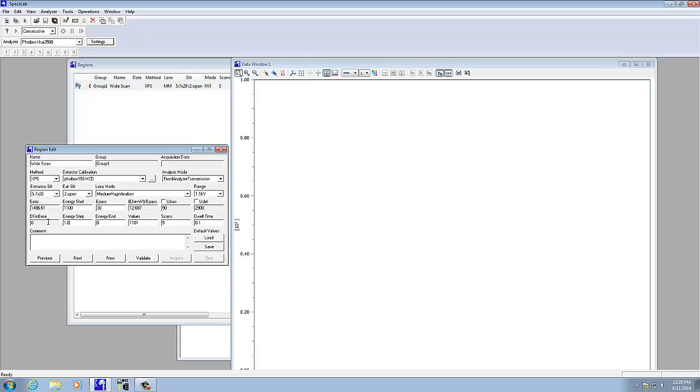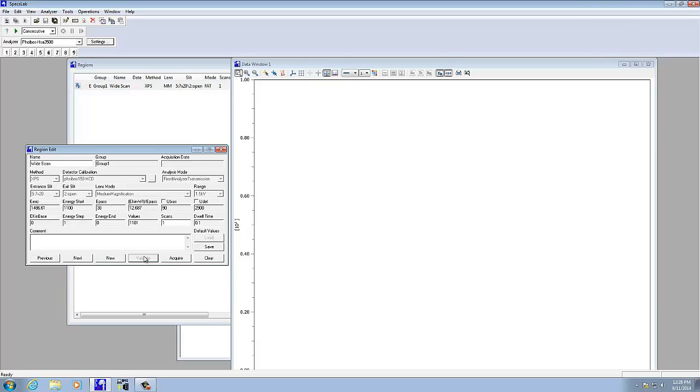For a wide scan, 1 EV or 2 EV is fine. If instead you're doing a narrower scan, you'd probably want to set that to 0.1 or 0.2 EV. I'm going to do a single scan here. We can always add more to it later. After all that information is entered, then you have to hit the Validate button. That just makes sure everything's okay, and everything stayed the same, 1,100 to 0 EV.